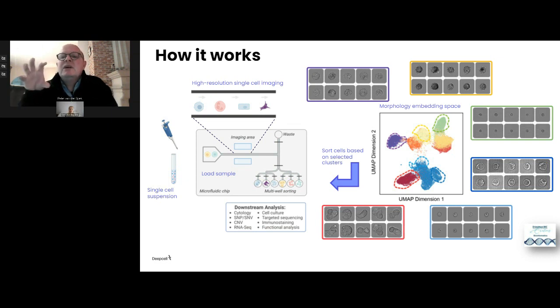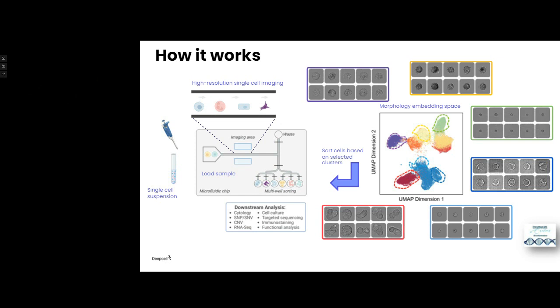Of course, if you look at a pool of mixed cells, you're way less sensitive than after you have separated out a clean fraction with single cells that are morphologically identical. And then basically you can start to look at what underlying mechanism is potentially causing a disruption in the disease that you try to address. Okay, what do we want to see now?